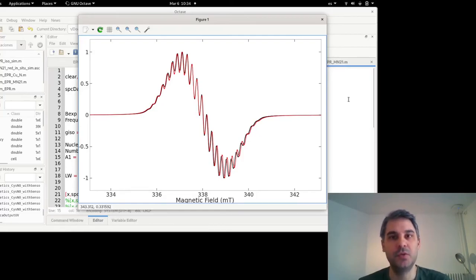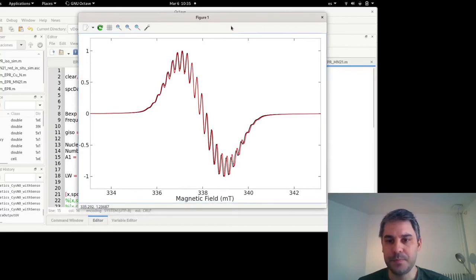It is very important to know if the values for the hyperfine splittings and the number of nuclei that we include, for example, 3 equivalent hydrogens, come from a methyl group that I know is there. So it makes sense that I included that. It's not random. You should not put random nuclei and try to get a perfect fit, because then you could be basically inventing a molecule, just making up parameters that don't make sense.